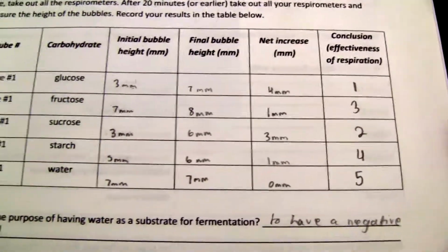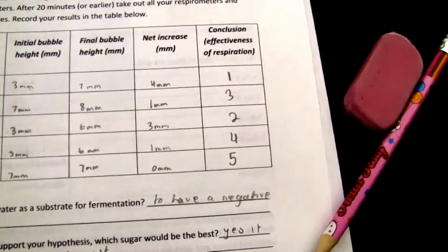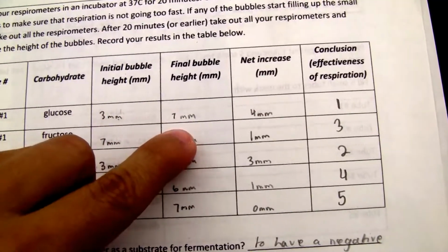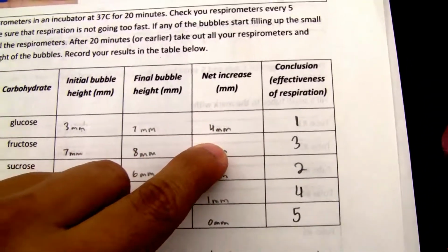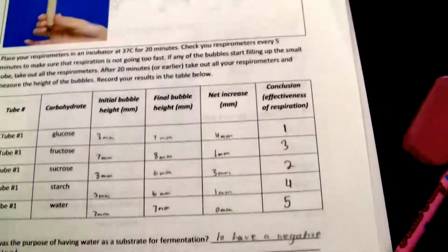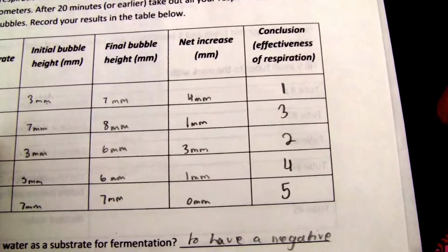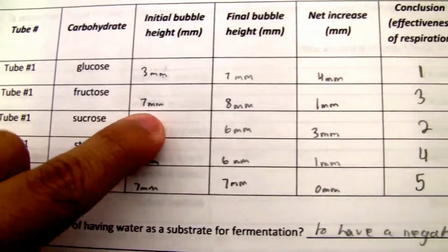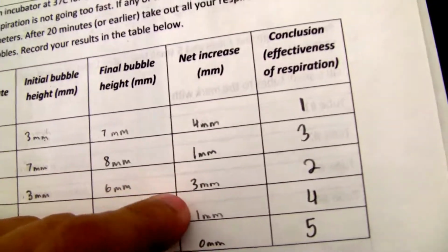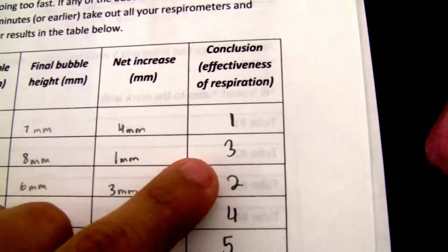So these are our results. Test tube 1, we had glucose. Our first one was 3 millimeters. Our final was 7 millimeters. Net increase 4 millimeters, and it comes out in first place as the one that has the best fermentation. Test tube 2 with the fructose had 7 millimeters at first. Our final was 8 millimeters, and the net increase was 1 millimeter, so it came in third place, which we did not get right.